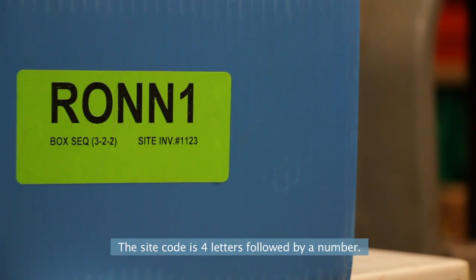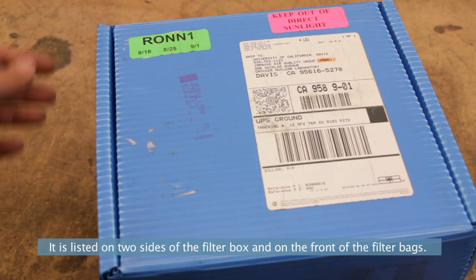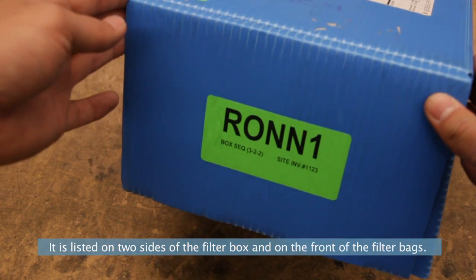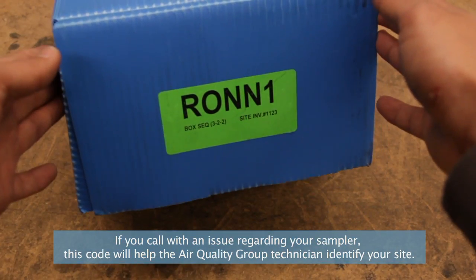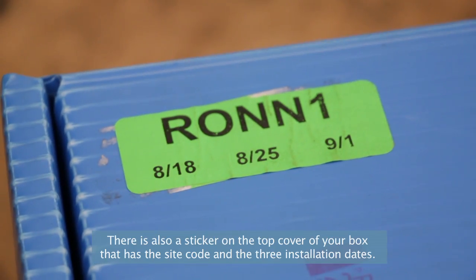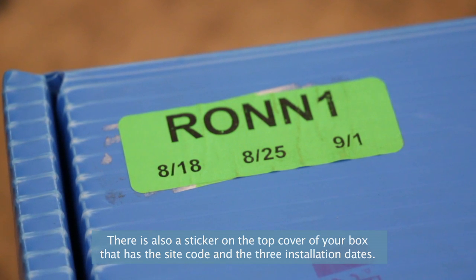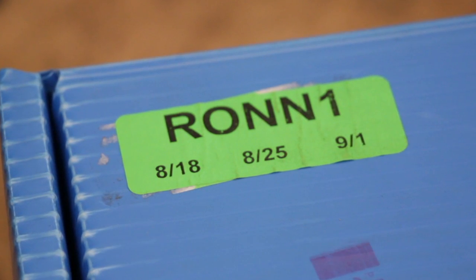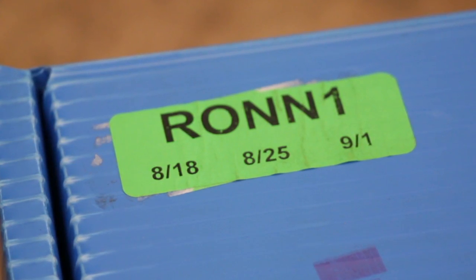The site code is 4 letters followed by a number. It is listed on 2 sides of the filter box and on the front of the filter bags. If you call with an issue regarding your sampler, this code will help the air quality group technician identify your site. There is also a sticker on the top cover of your box that has the site code and the 3 installation dates. Make sure the dates on the box are correct for the current sampling period.